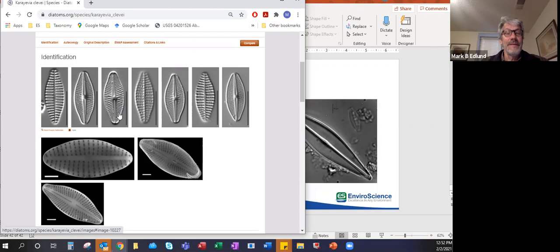Mm-hmm. Yeah. It used to be that when people published big floras, they'd often even say, here's where I measured my striae, and draw it, put an image of how they did it. And we also shared a link there of how on centric diatoms, since they're round, the challenges that you have in measuring striae density on a thing.